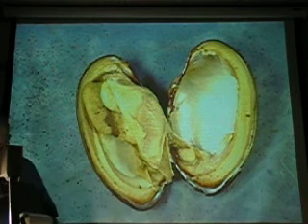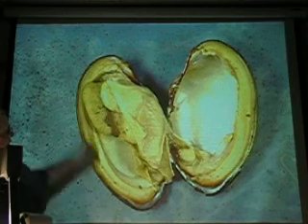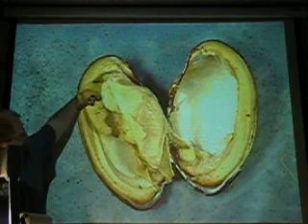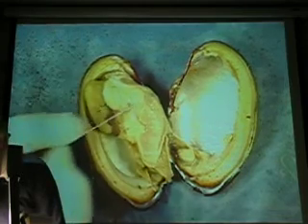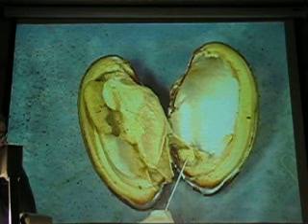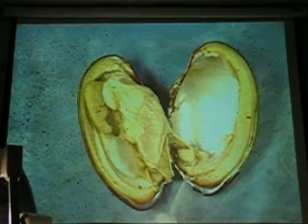I don't know where the anterior is. Where is the anterior? What's this? Oh, I can point down here. The labial palp — we'll always establish that for you. So then what muscle is this guy in here? Posterior adductor.